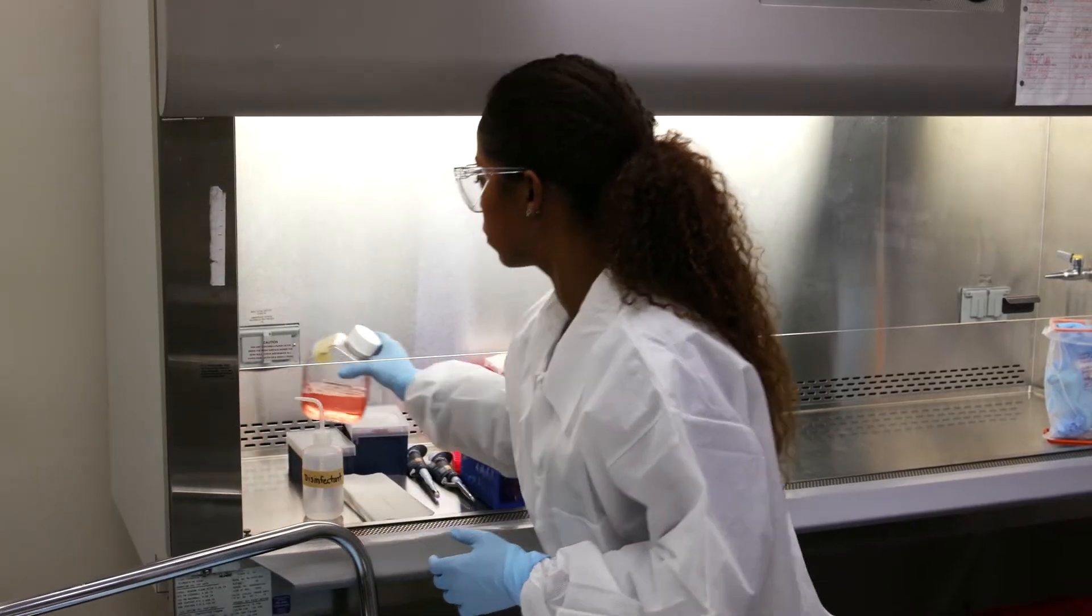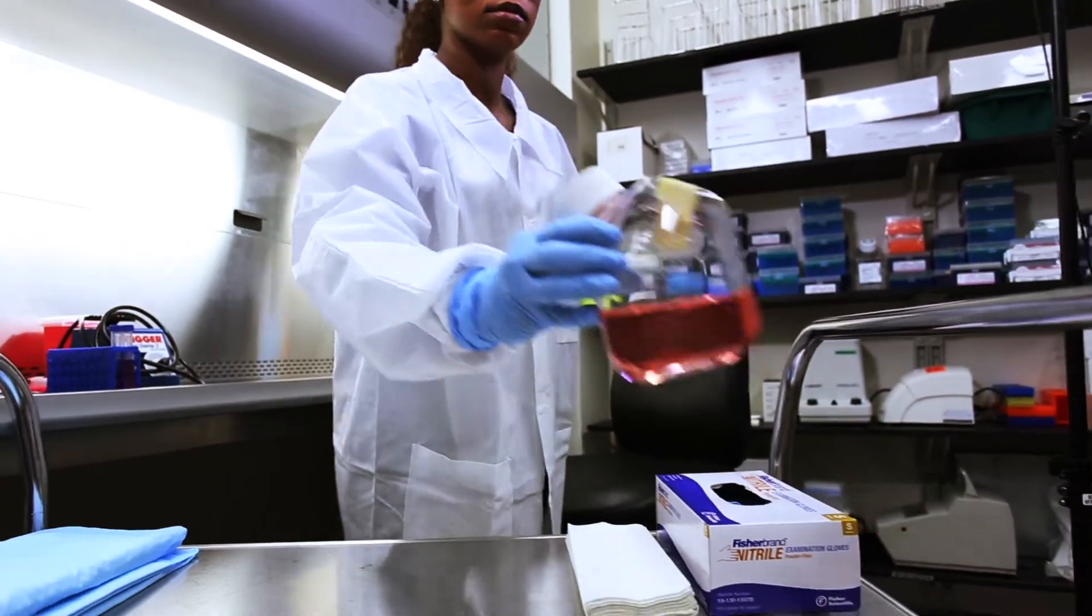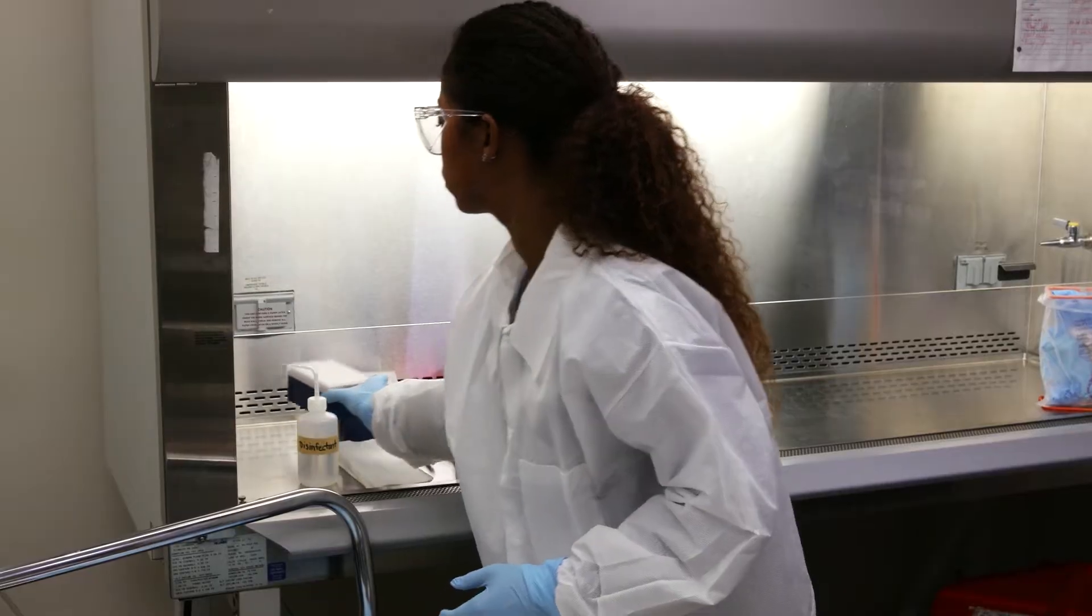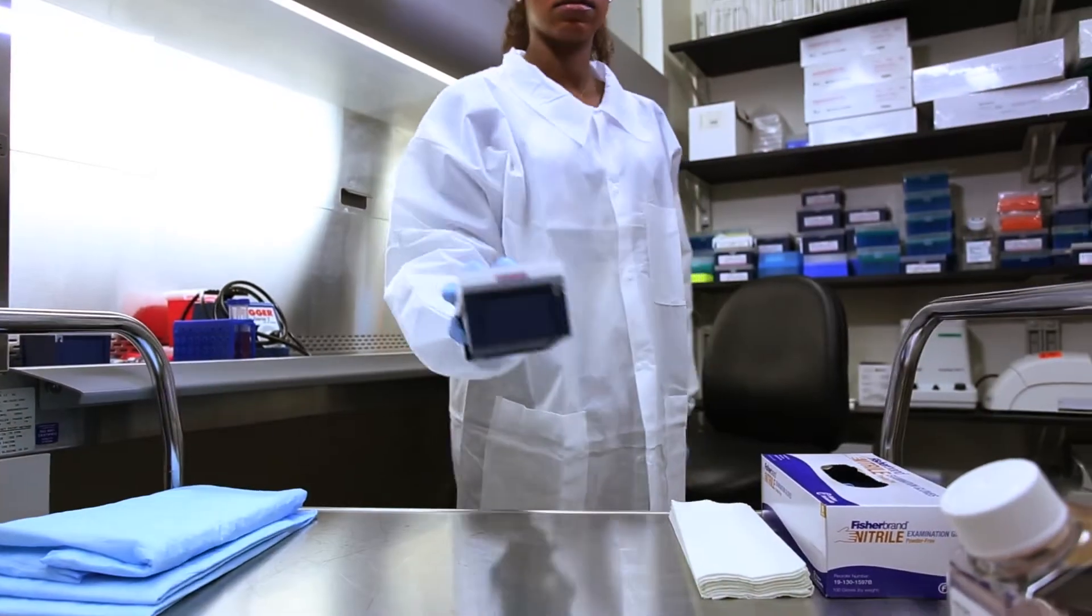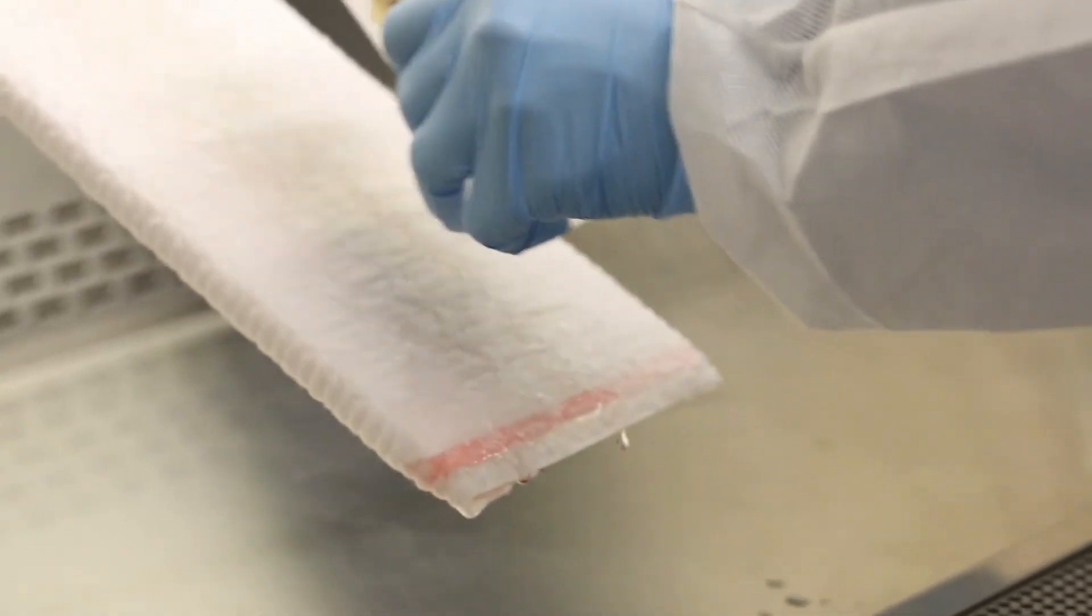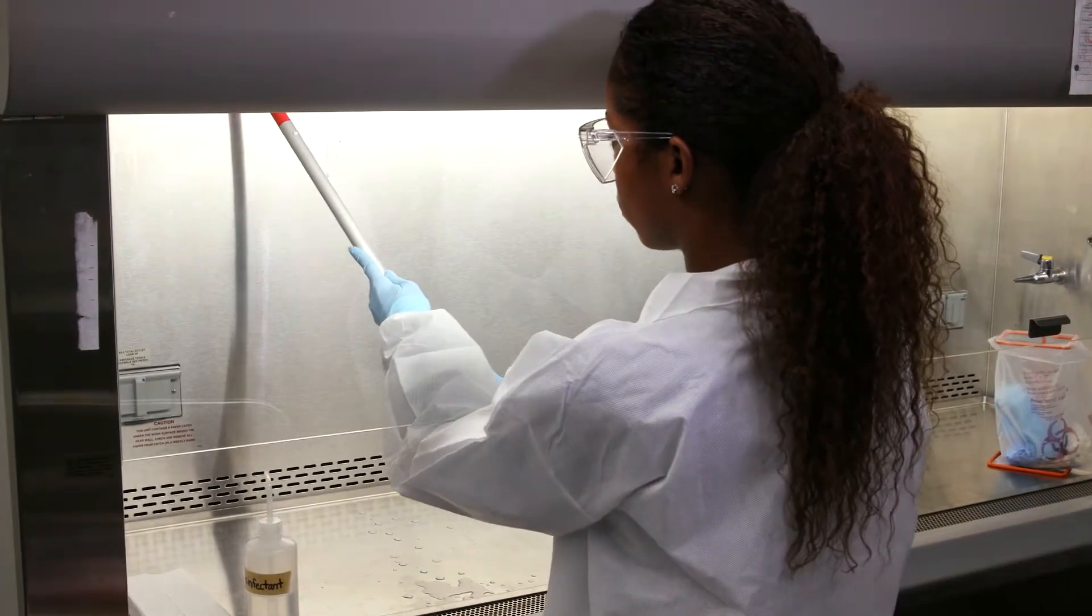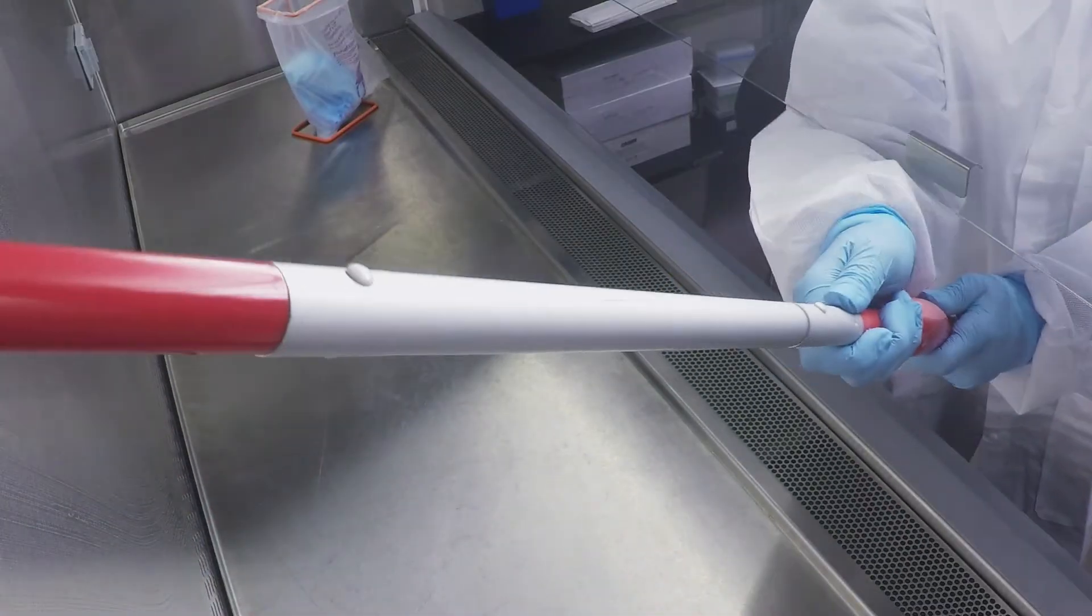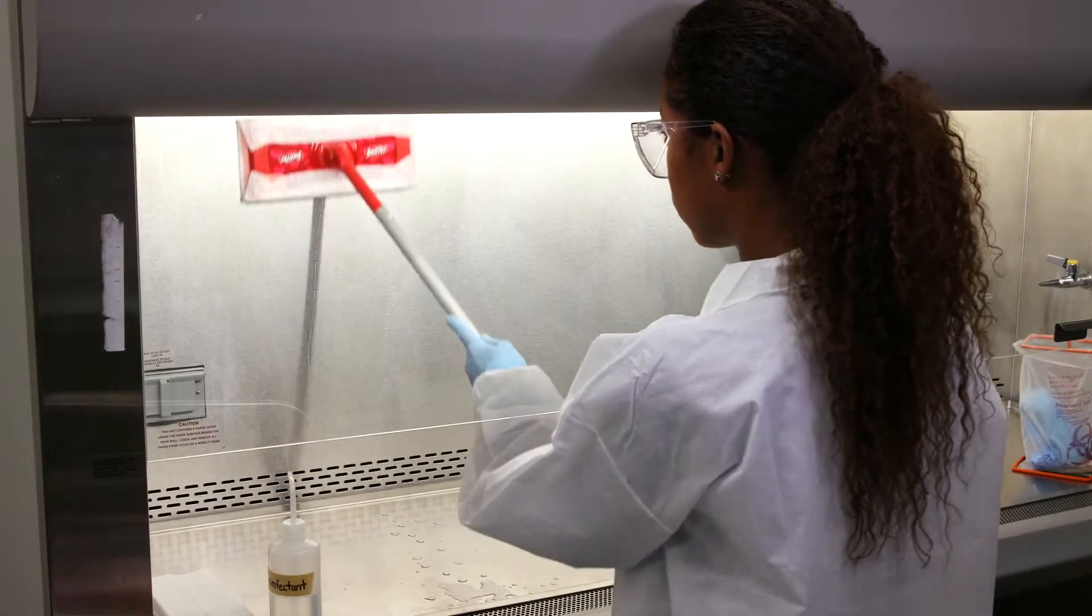Remove other materials from the BSC, placing them on your cart. After removing everything from the cabinet that needs to come out, proceed to decontaminate the inner surfaces of the BSC as you did before beginning work. Don't forget the sides and back wall as well as the inside of the glass sash.